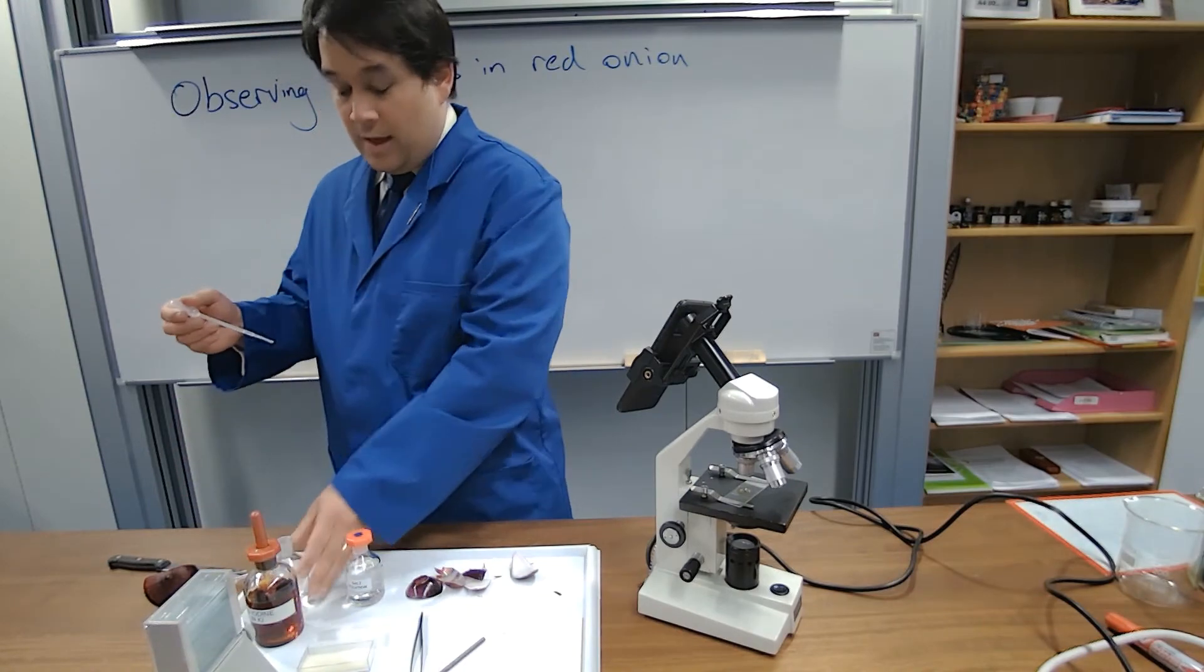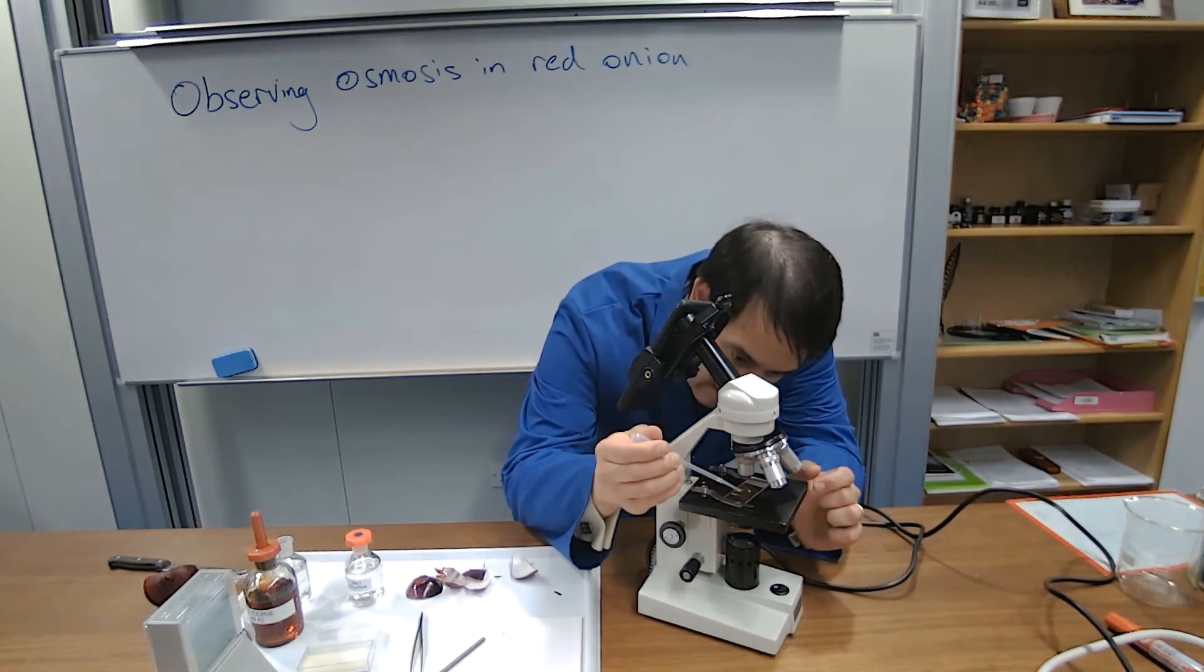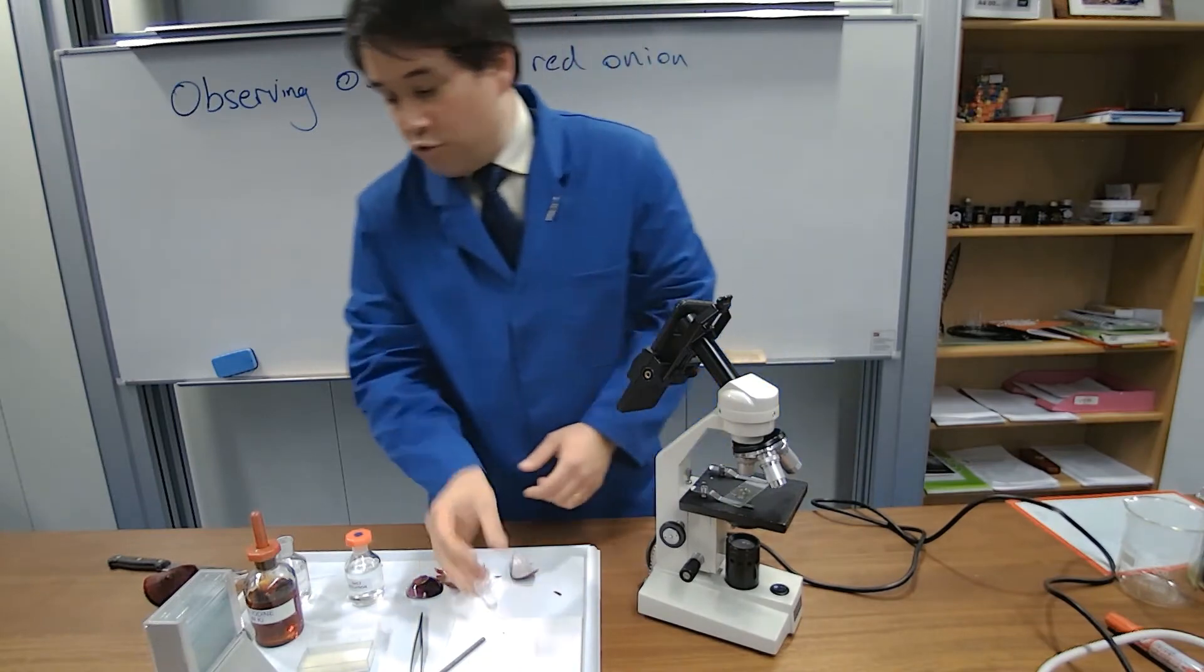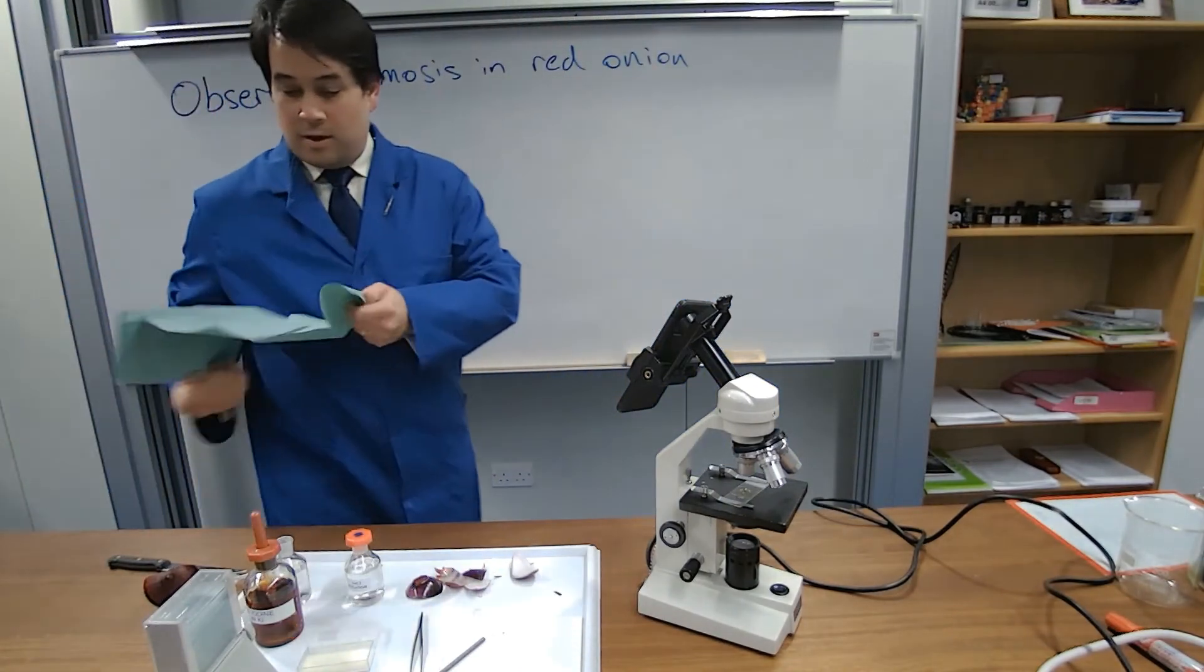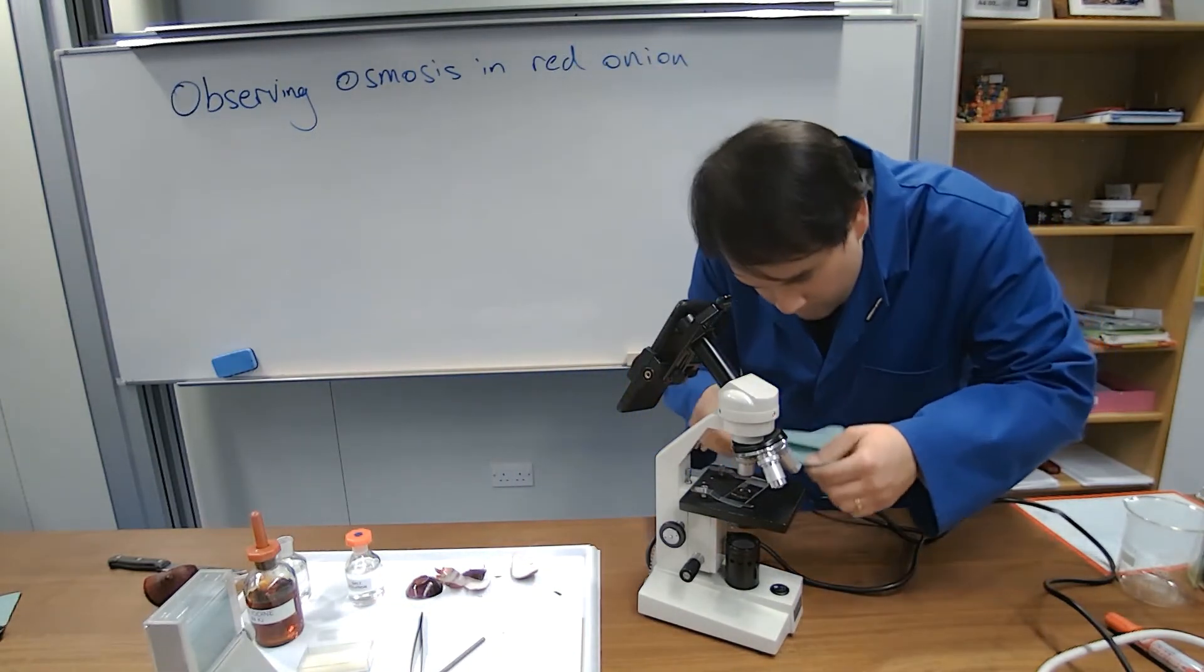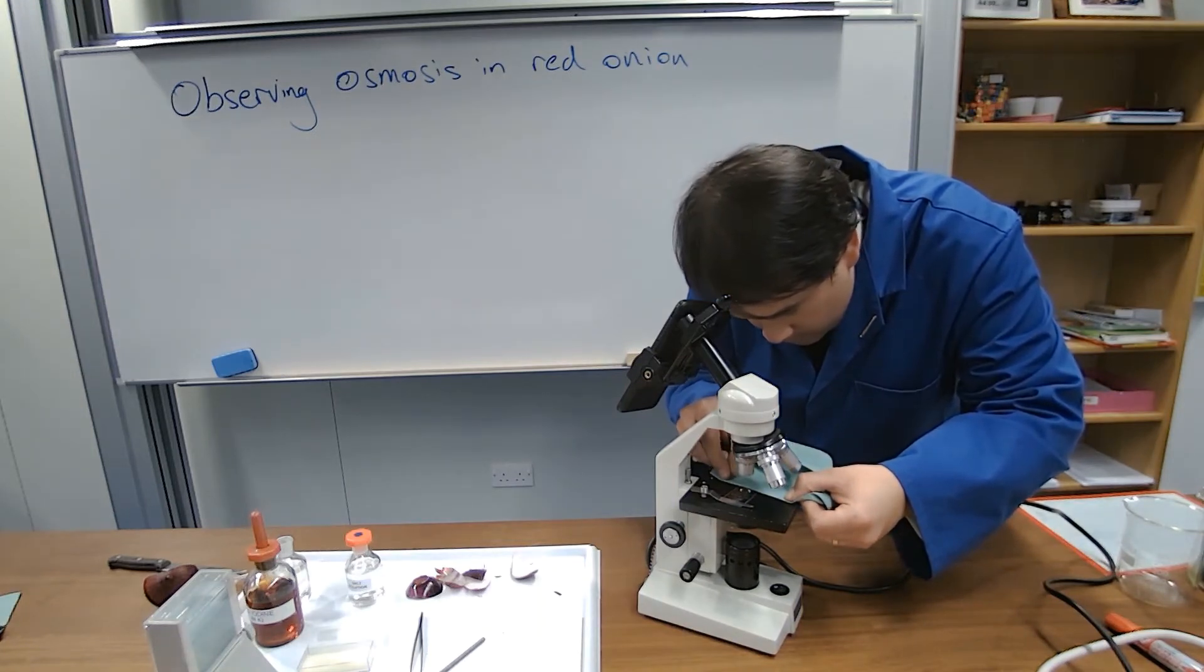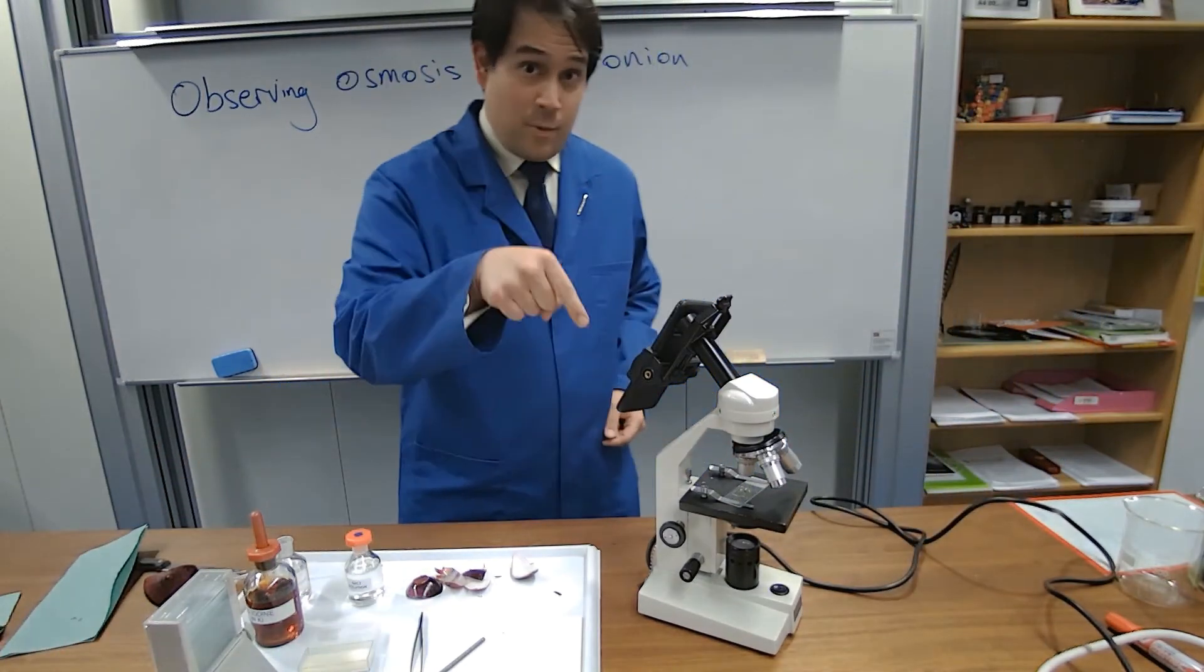Now, how I'm going to do that is with water. I'm going to introduce that very slowly on the slide, and then we're going to draw that water through using some paper on the other side of the slide, like so. Now let's have a look at what I can see.